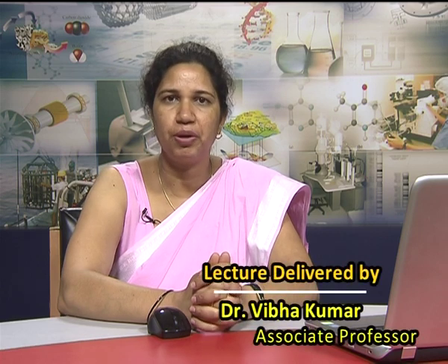Dear viewers, so up till now we have been discussing the different techniques in spectroscopic methods. In the earlier episode, we were discussing the inductively coupled plasma. So today we will be continuing with the same technique, and we will also discuss another technique, which is atomic fluorescence spectroscopy. So let us first of all continue with ICP, that is inductively coupled plasma.